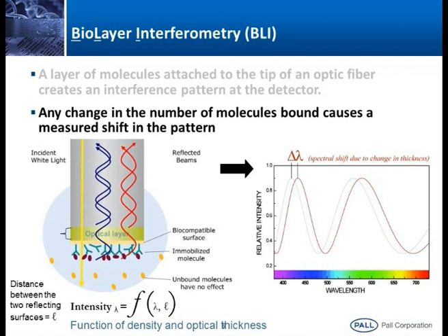So, if you look at this diagram, the antibody starts binding to this ligand. Earlier, there is always a constant reflection from the internal optical layer. Now, there is a reflection coming from here. If you look at this, the path length increases. Earlier the light was coming from here. Now, the light is reflecting from here.